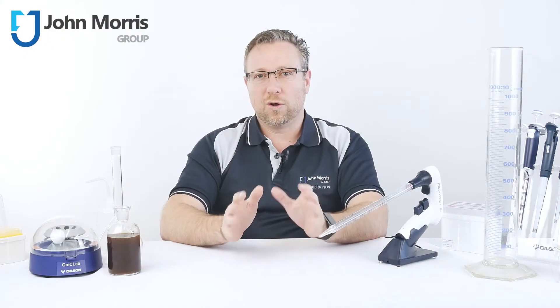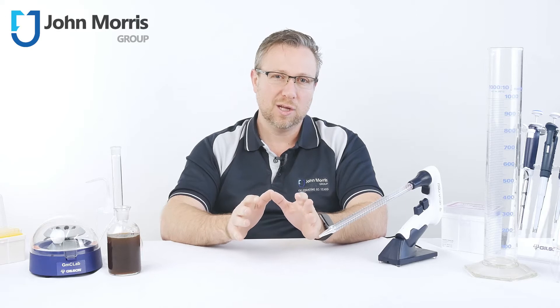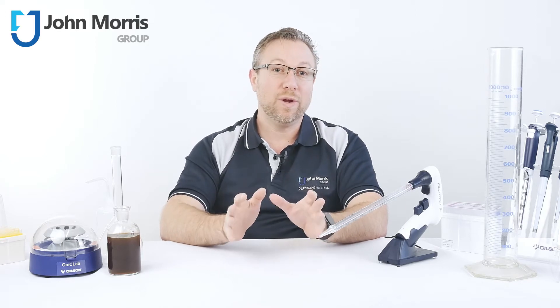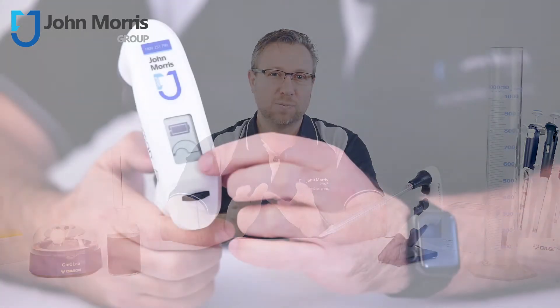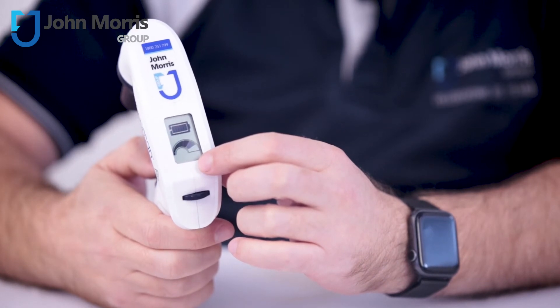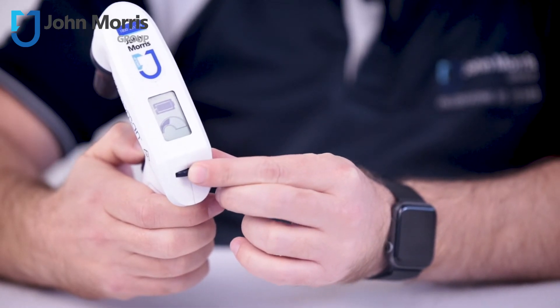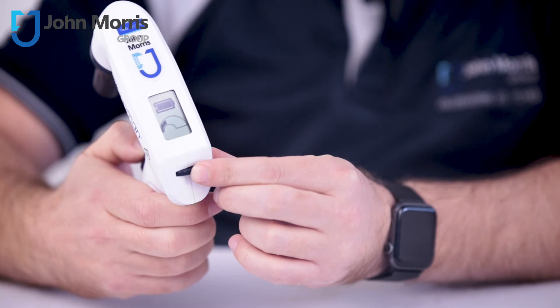Of course, it doesn't matter what type of pipette your controller takes if it doesn't offer you accuracy and precision, and this is where the Gilson Macroman really stands out. The Macroman has pressure sensitive buttons which enable you to control the liquid flow at eight variable speeds, or if you want, you can rotate this handy wheel as a kind of cruise control to set a maximum or constant speed limit.